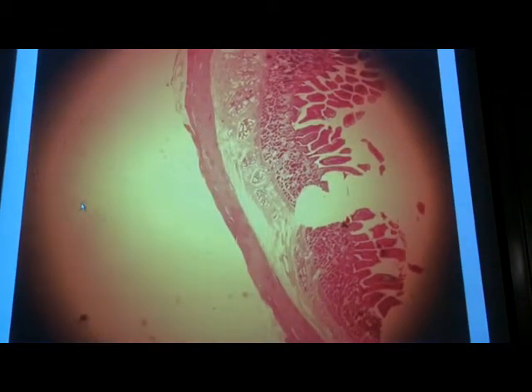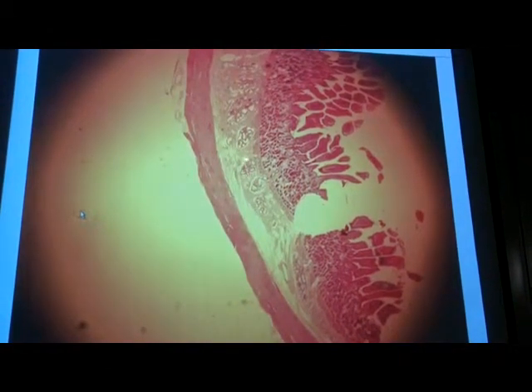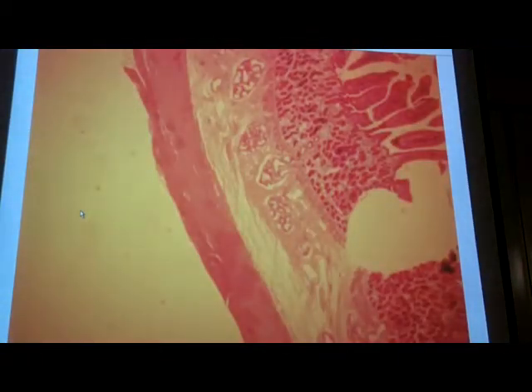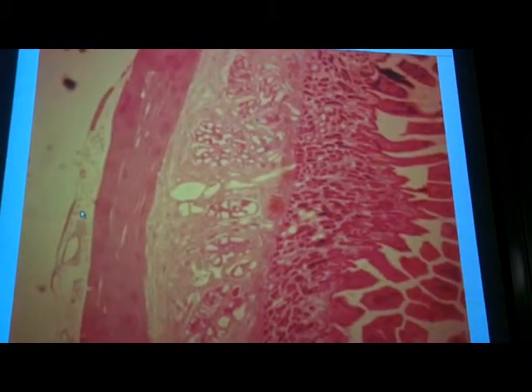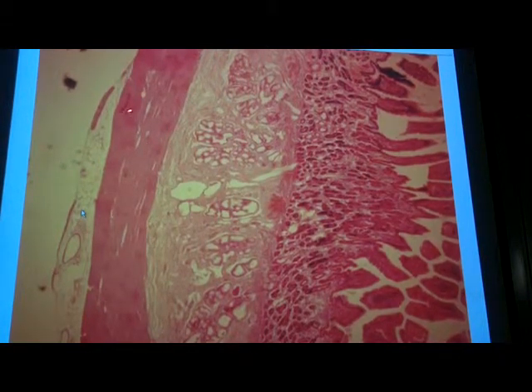All right, so this is the duodenum. Let me point out the Brunner's glands. There's a submucosa right there. That's the Brunner's gland. Let's go to a higher magnification. First, I would orient yourself. Get your layers of the GI tract wall right. There's the mucosa, submucosa, muscularis externa.